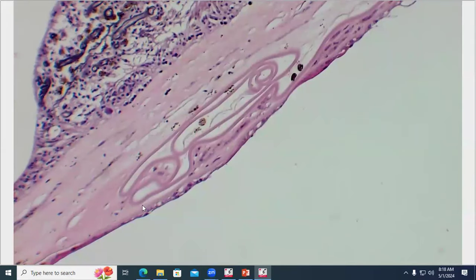It's kind of reduplicated itself as well to some extent, but this curled up end, and we have the end right there. So lens capsule rupture posteriorly right where the porcupine quill is. We assume that the porcupine quill traumatized the posterior lens as well as stuck itself through the retina.